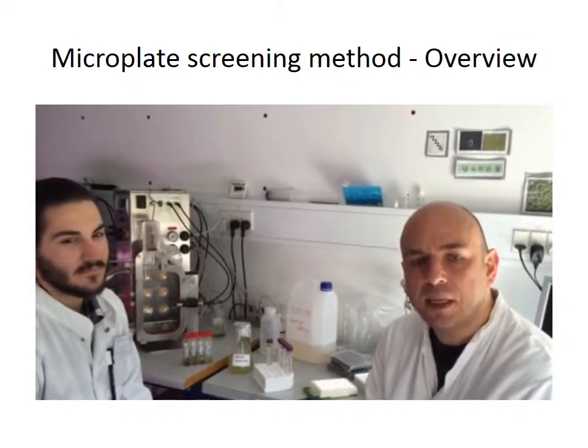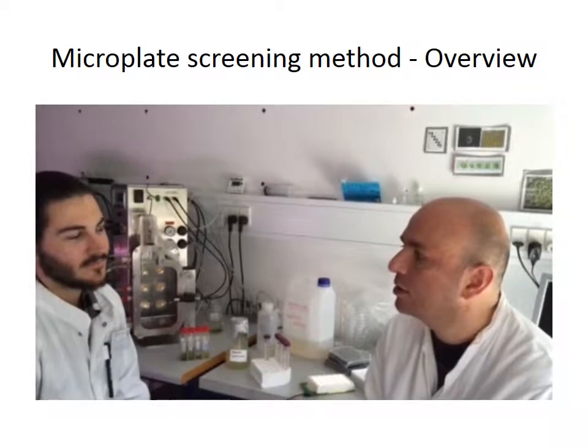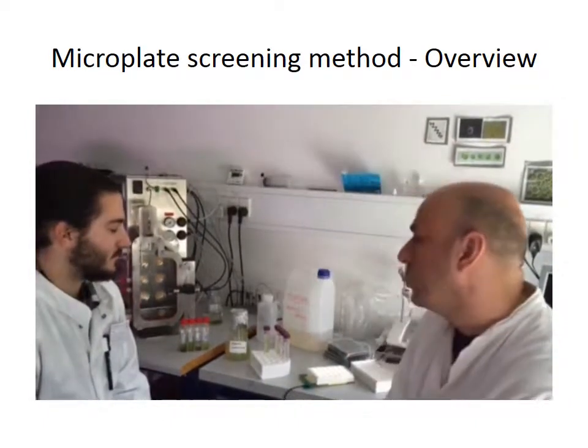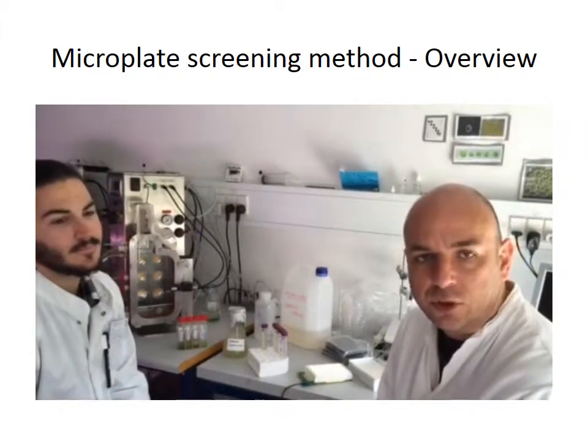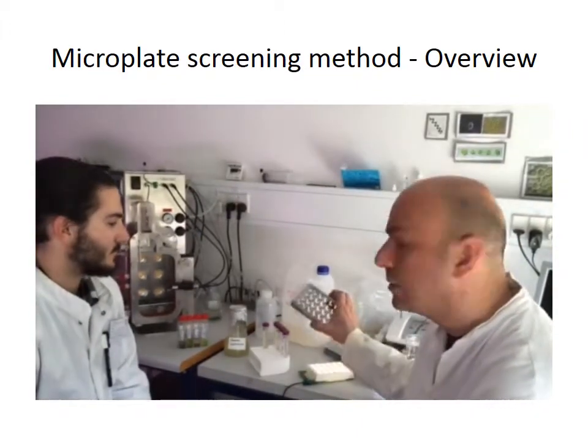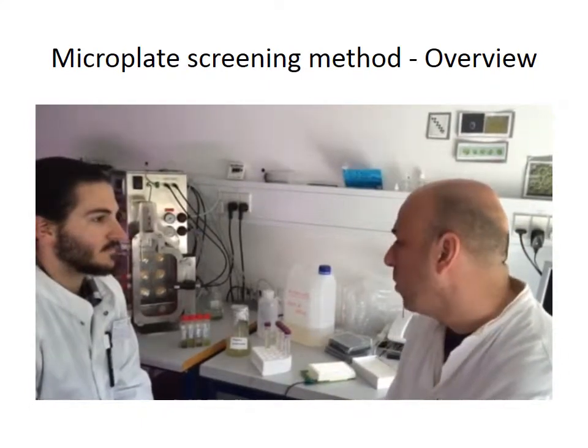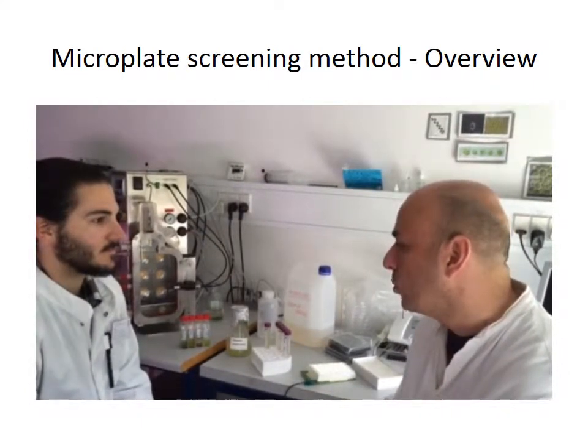Hello everybody, my name is Davide Francisci and here is a student, Aitor, from Spain, and we are going today to make a little demonstration on how we use microplates for the screening of microalgae in wastewaters. So first I'm going to show you what we have here.